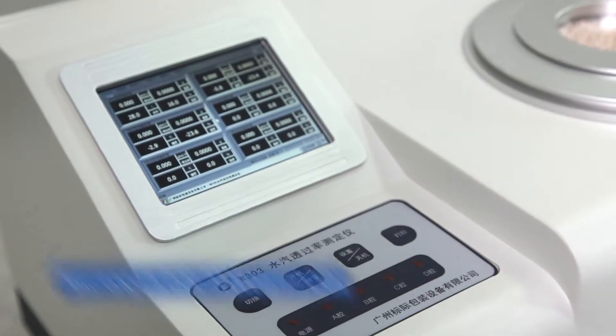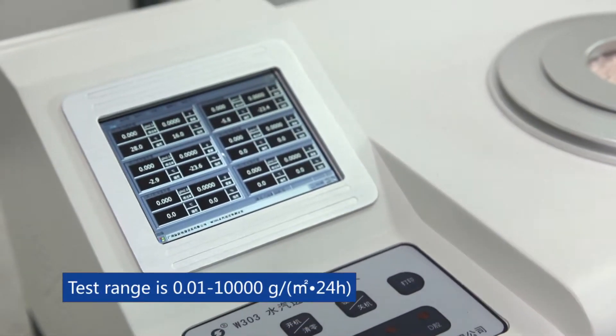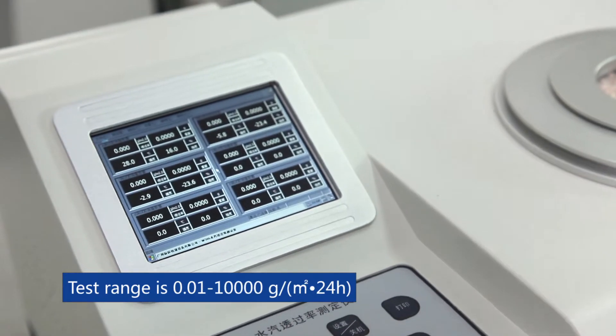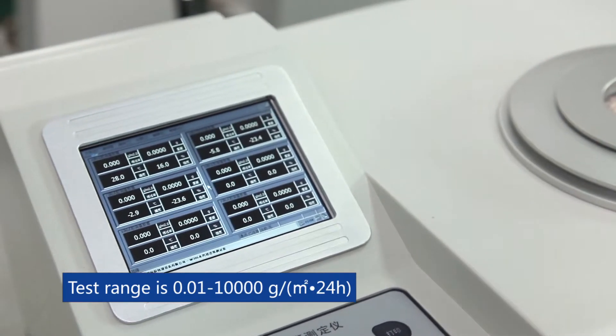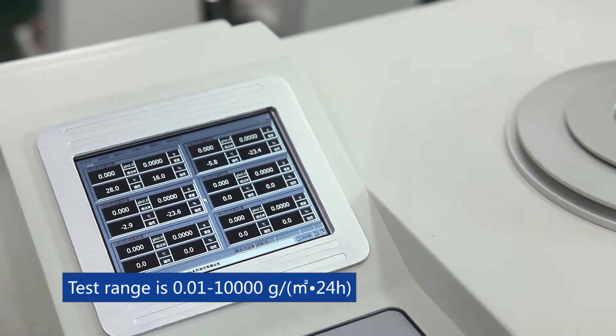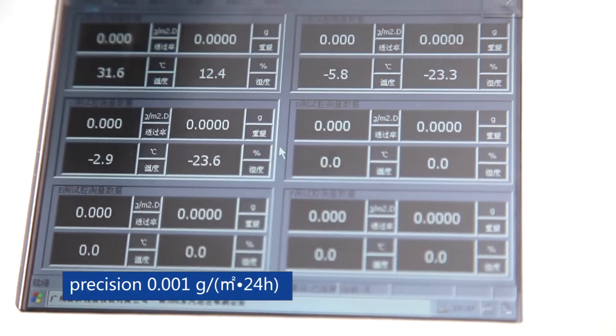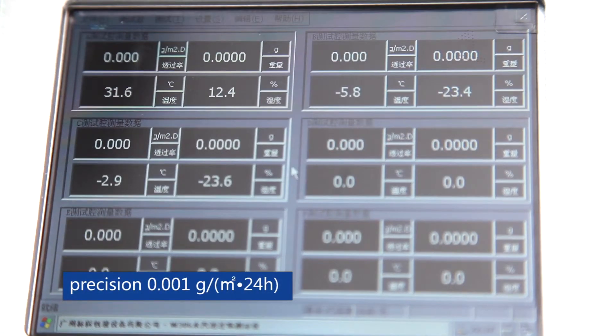Test range is 0.01 to 10,000 grams per square meter per 24 hours. Precision is 0.001 gram per square meter per 24 hours.